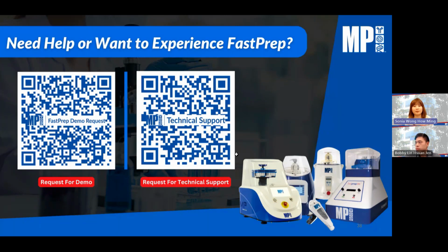I think for Annabelle's question, we probably would like to know more about whether the starting material was enough. If you were to provide us with that information, we will be happy to know, because starting amount will actually affect your extracted RNA yield and quality.